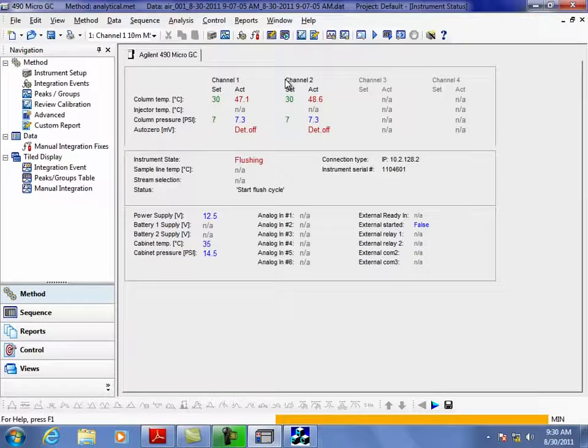If they're limited on samples, there are pretty small Tedlar bags, not real small, like 100 mil or 200 mil, I think they are. I'll talk to them about it when they're here. Okay. That's the thing I think we need at least. For us, the quantity of gas is not a problem. No. For them, it's a problem. So we probably need what do you call this bag? Tedlar bag.